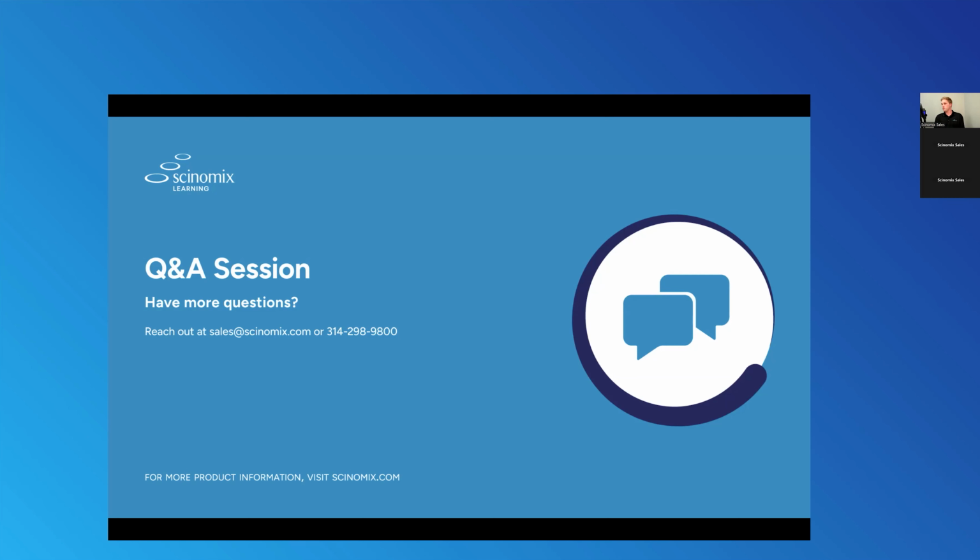Yep, that's a good lead into Belinda's question of what material are the consumable tips made of. Yeah, so these are lab user dependent, right? Whichever ones you have, typically we can work with. They have to be automation style tips, but whether they're carbon or simple plastic doesn't matter to our system.